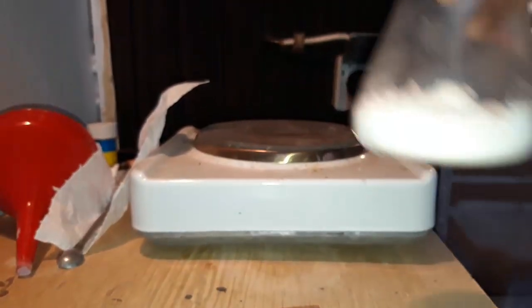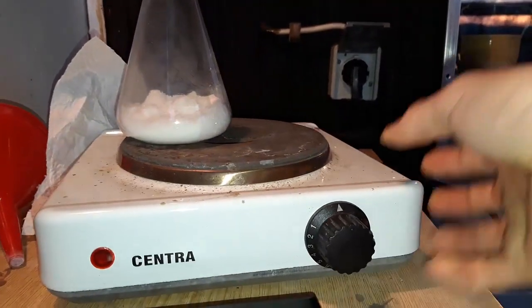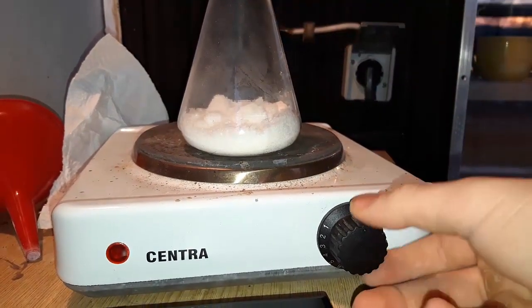Put it on a hot plate and turn on the heating. Cover the top in aluminium foil to prevent moisture getting in.